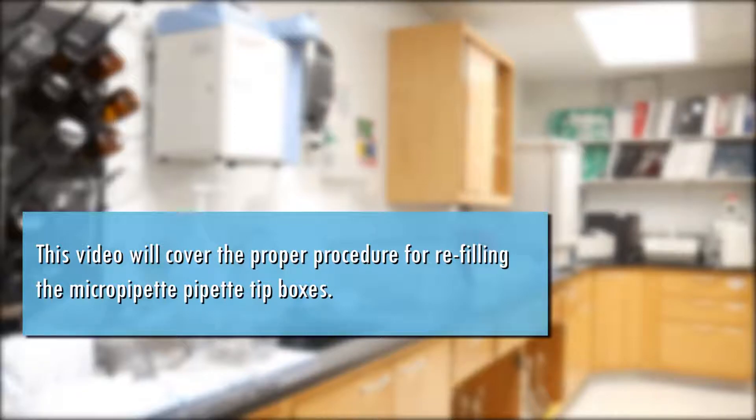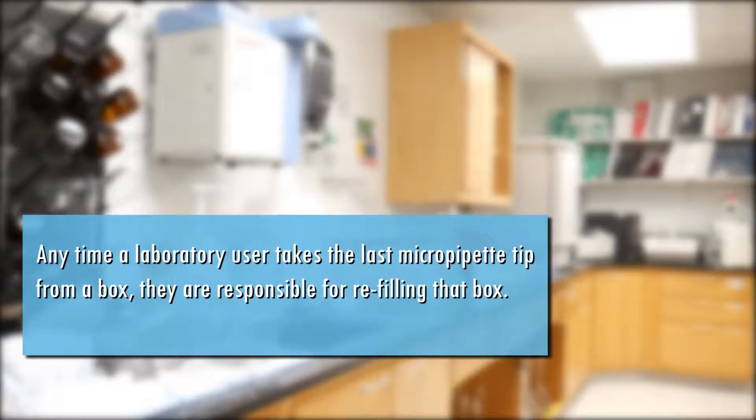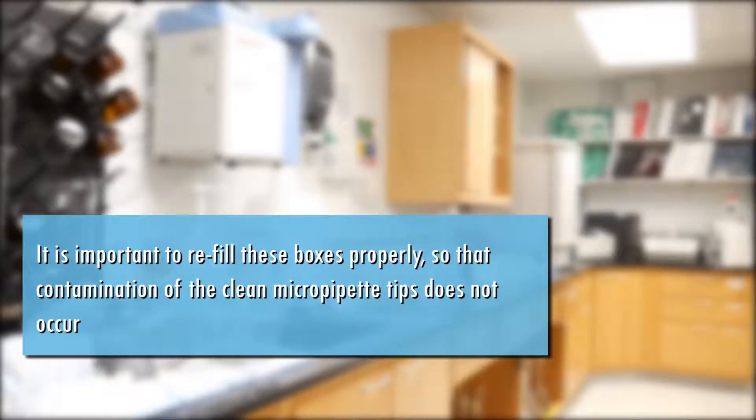This video will cover the proper procedure for refilling the micropipette tip boxes. Anytime a laboratory user takes the last micropipette tip from a box, they are responsible for refilling that box. It is important to refill these boxes properly so that contamination of the clean micropipette tips does not occur.